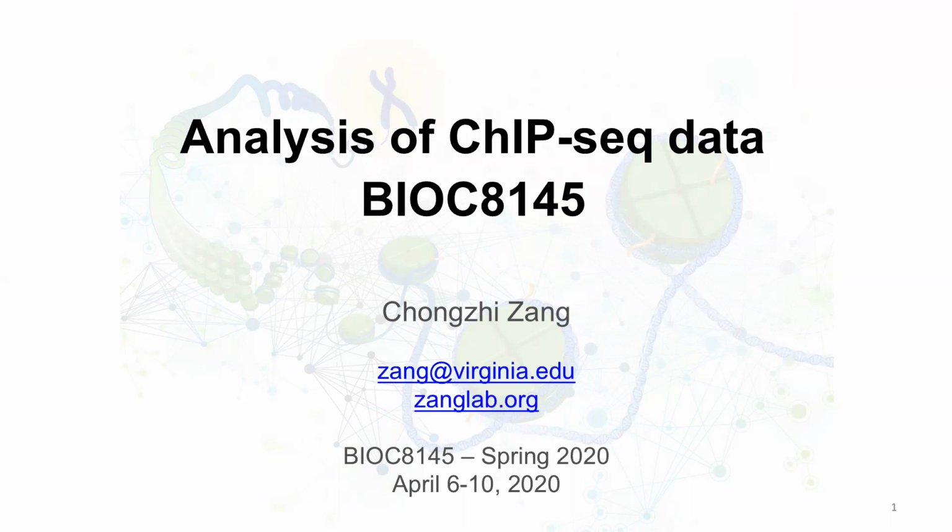Remember, tiling arrays gave you nearly as good data, not as good, but nearly as good. But it was ridiculously expensive because you needed a lot of chips. Yes, at the time.